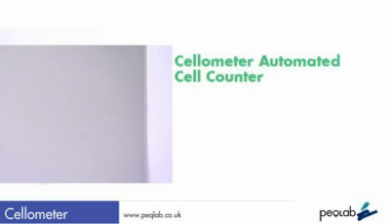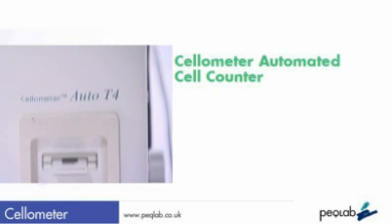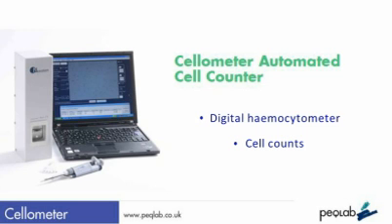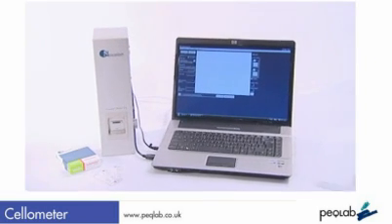This is a short demonstration of the Cellometer automated cell counter. Designed to replace time-consuming hemocytometer counts, the Cellometer is an easy-to-use and very effective instrument for rapidly counting cells, providing data on cell number, concentration, size and viability. Let's have a look at it.